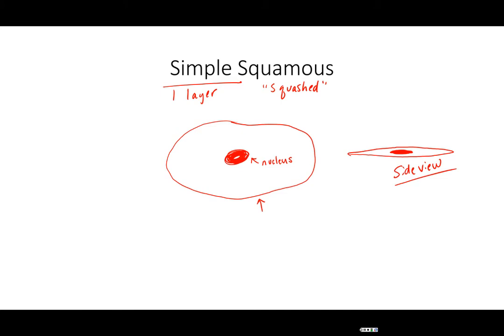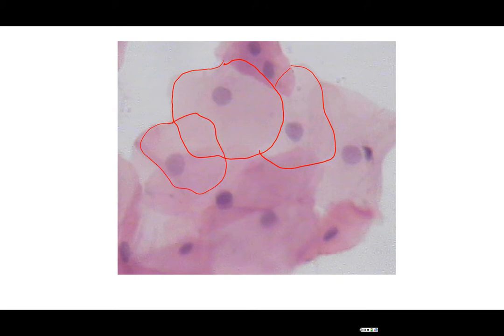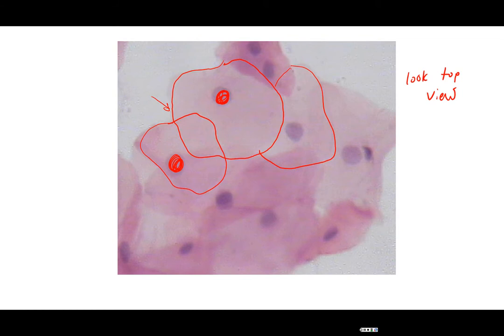Let's take a look at an actual picture of a slide of simple squamous. We should be able to trace out our oval-shaped cells. Notice here that we're looking at the top view of our cell. We do get a little bit of overlap, but they're not stacked one on top of the other. You are seeing your darkly stained nucleus. Using the fried egg analogy, this is looking at the egg in the frying pan — you're looking down at it.